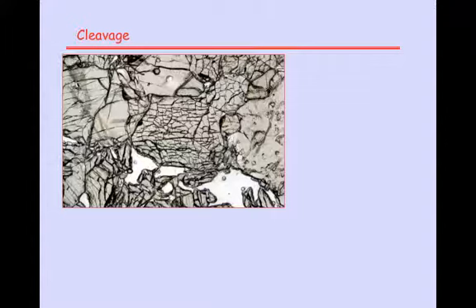Take a look. Do you see any lines that create a regular pattern that are relatively straight? And as I just said, pyroxenes have 2 good cleavages. So look at that grain in the center and see if you spot any. I'll wait just a moment.